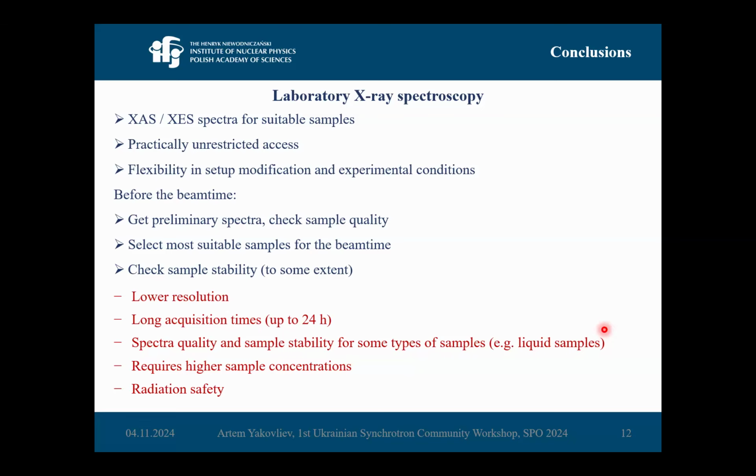And the last one is radiation safety, because you need to put your setup inside a hood or some kind of shielding, and your staff have to go through radiation safety training in order to work with X-rays in the lab. Of course, when you go to a facility, you also have to go through training, but here in the lab you need to have it constantly.